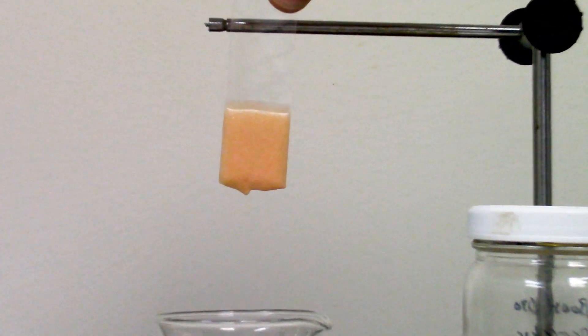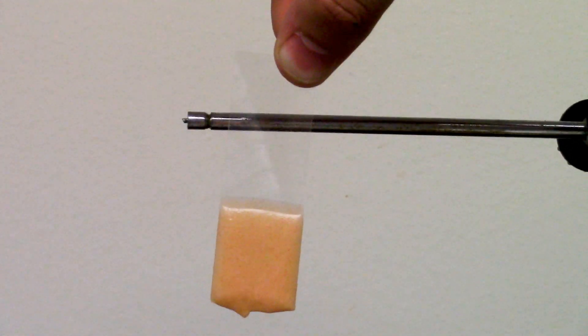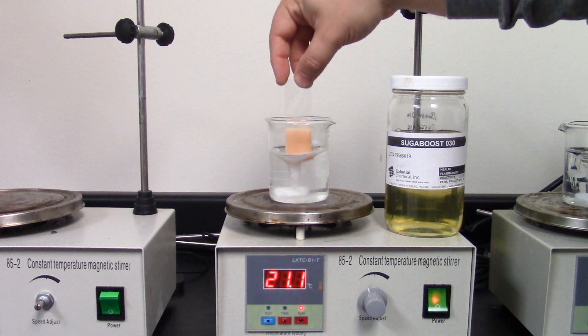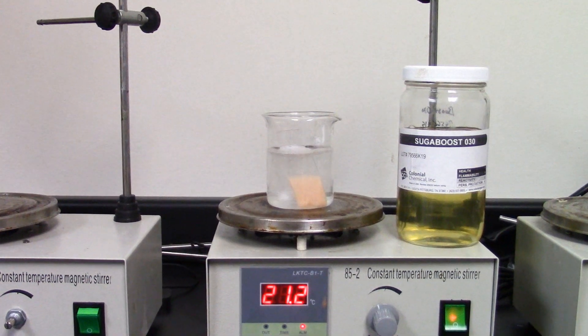Here you can see the food soil actually cast on the slide. As shown on the previous slide, it's lard, corn oil, egg powder, and some dye to make it a little easier to see. We picked this because it's a pretty heavy duty soil, and it also demonstrates three of the major categories you're looking at in hard surface cleaning.